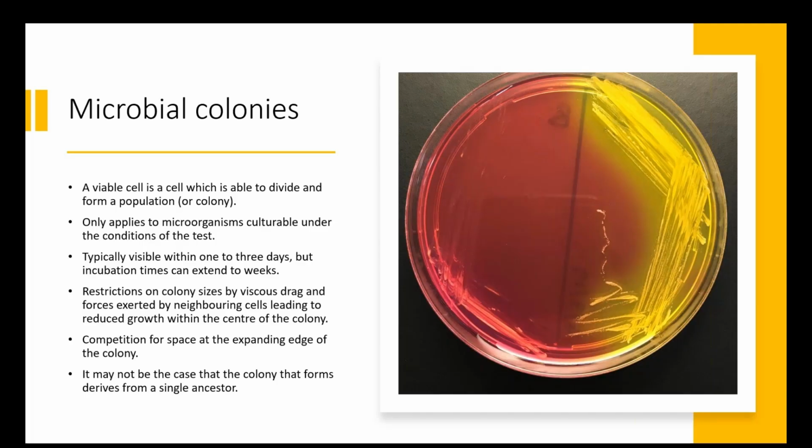And there's always going to be eventual restrictions on the colony size. That's affected by viscous drag and other forces that are exerted, particularly by neighbouring cells. So these will restrict the size of the colony that can form, and there's always going to be competition for space if we have a higher number of organisms that we're trying to grow.